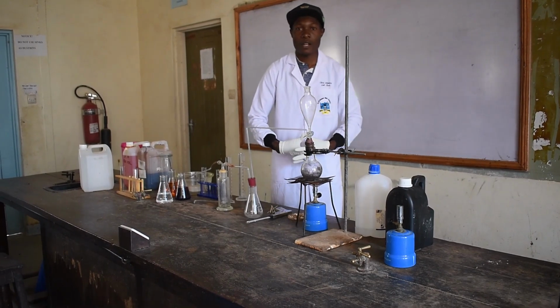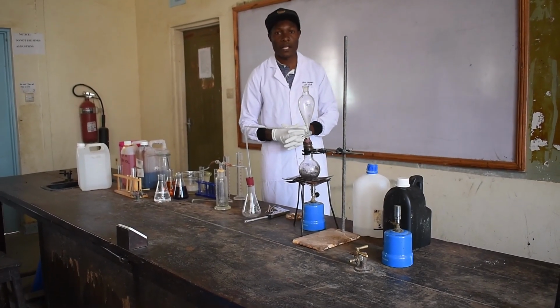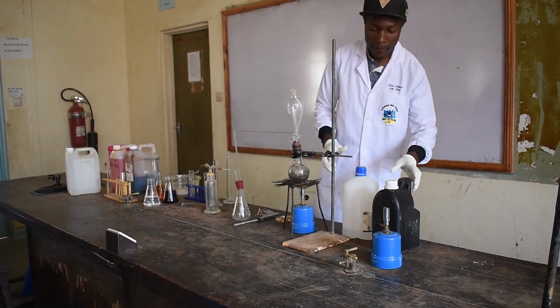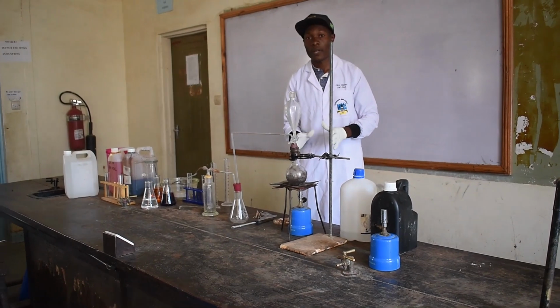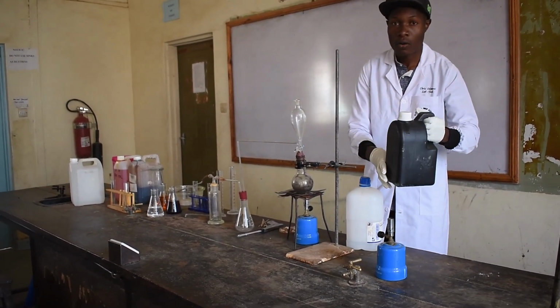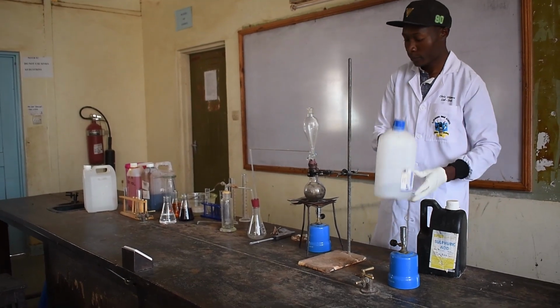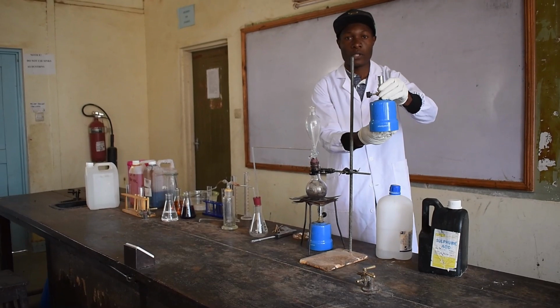Hello guys, under organic chemistry 1 we are going to look at lab preparation of ethene gas. So without wasting time, we will go through the lab apparatus and all reagents required for the preparation of ethene gas. Here we have our concentrated sulfuric acid. We have ethanol. We have a source of heat, a burner.